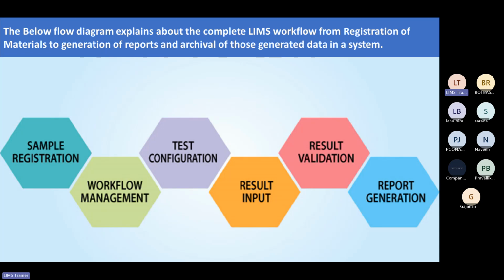Then see the workflow. The material workflow, like sample registration, then the workflow of that particular sample, then test configuration, result input, result validation, report generation. All these activities I'm going to explain in further lectures, how this workflow happens, in the sessions. Then see, this is the basic workflow.